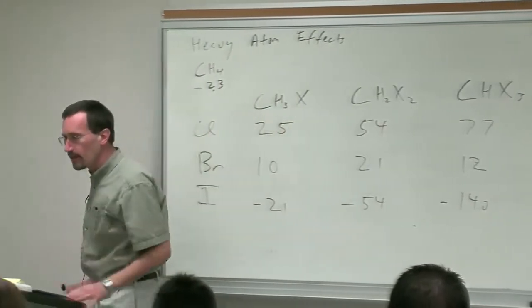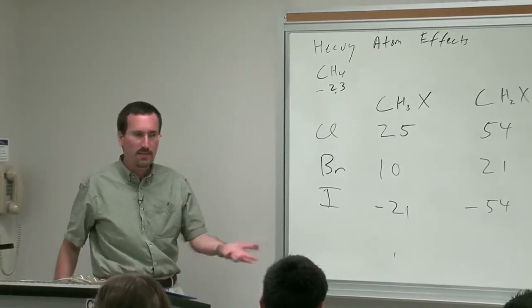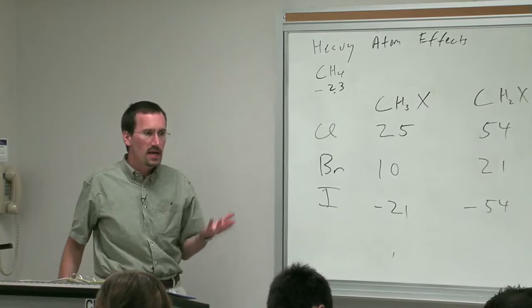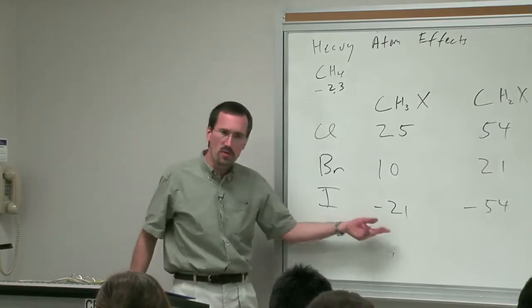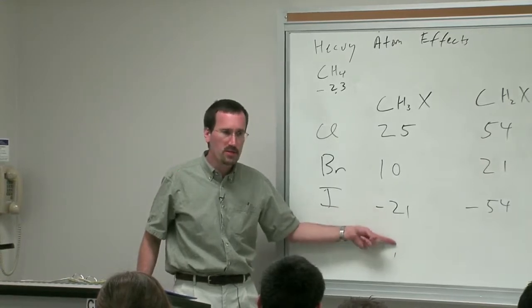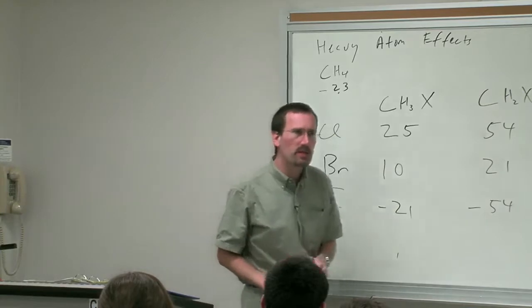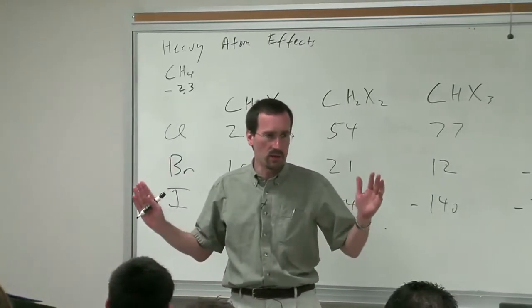Now, the practical implication for this becomes if you go ahead and do a reaction to, say, make an alkyl iodide in synthesis, and you don't go ahead and look upfield, you may miss your carbon and say, oh my God, I can't see my carbon. There's a parameter in the NMR called sweep width that you adjust.